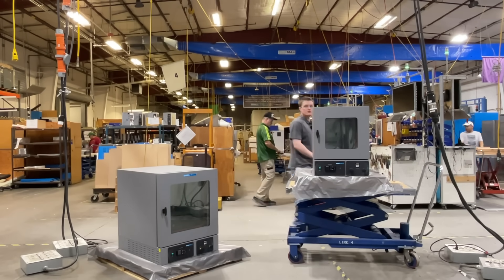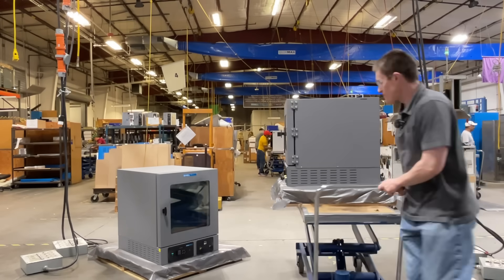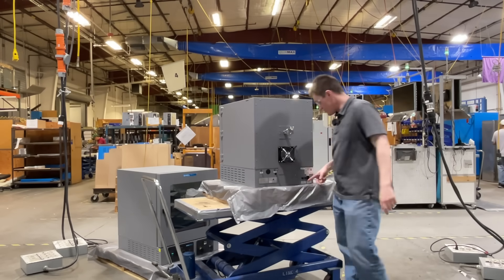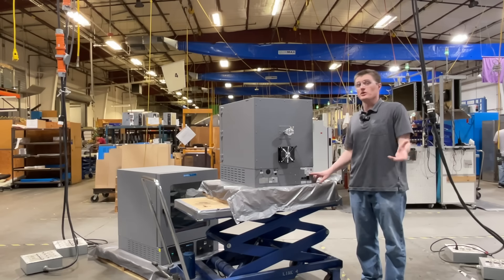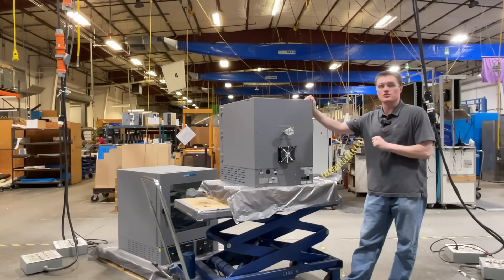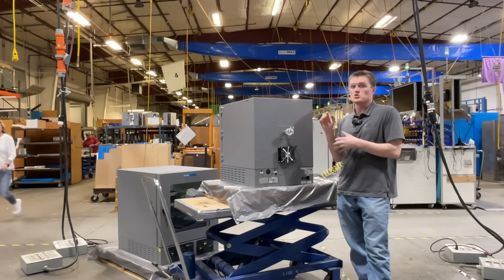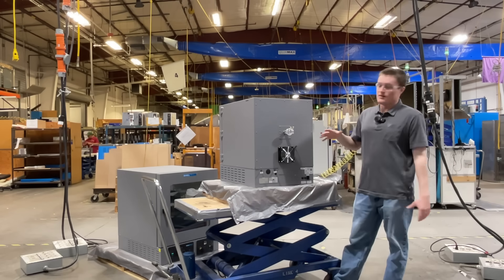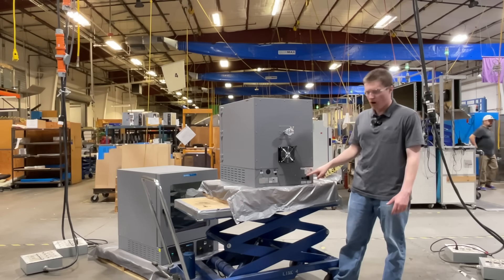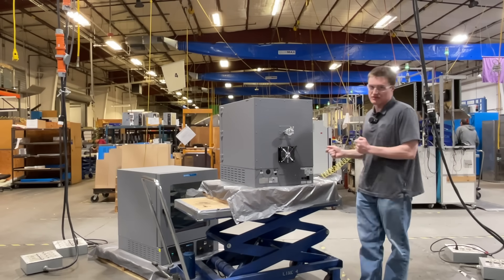Now, let's take a moment to look at some of the features located on the back of these units. The first thing you will see is the main power inlet, located in the bottom right — this is where you connect your unit to power. Both units are included with a power cord, which must be connected to a properly grounded electrical outlet. For information related to electrical safety and installation clearance requirements, please visit your user manual. Located to the left of the power inlet are two fuse drawers, externally located for easy fuse replacement.